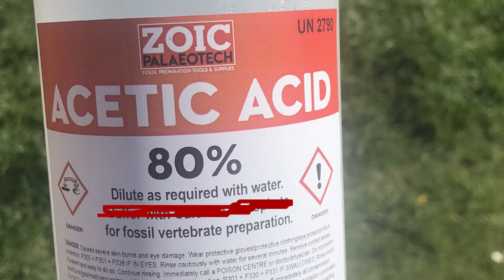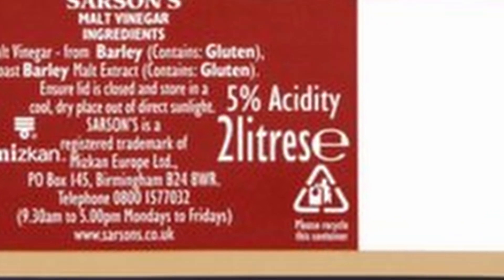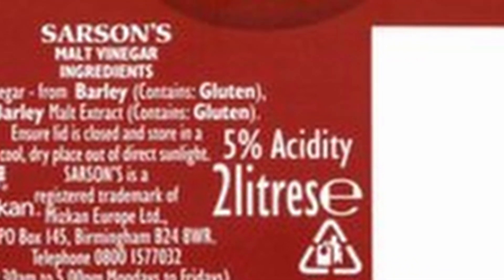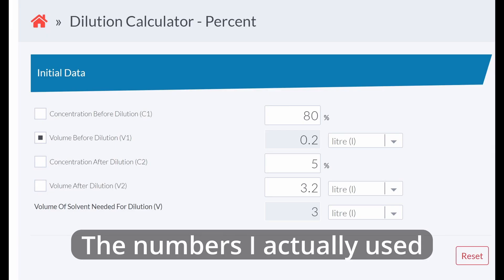We needed to dilute this 80% acid down to somewhere between 2 and 5%. For those who don't know, acetic acid is the same stuff as vinegar, and vinegar is an acid concentration somewhere in the region of 3 to 5% depending on the brand. Using this 80% concentration, you dilute it with 15 parts water to get down to about 5% concentration.